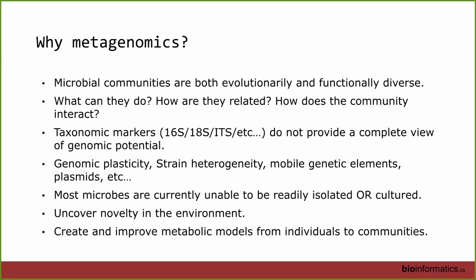It's important to note that metagenomics helps open up our ability to study organisms that are not able to be isolated and not able to be cultured. That's really the game changer for metagenomics, is that it allows us to access a part of the community that we are not currently able to bring into the lab readily. You can culture a lot of organisms, but it's very difficult, very time consuming. And we want to keep doing that, but we will always miss a large portion of the community. So metagenomics helps us deal with that issue.